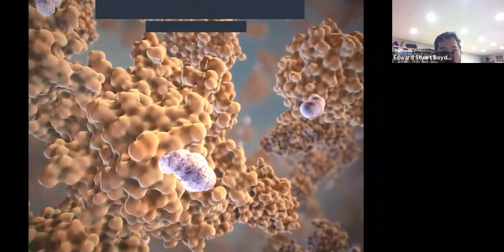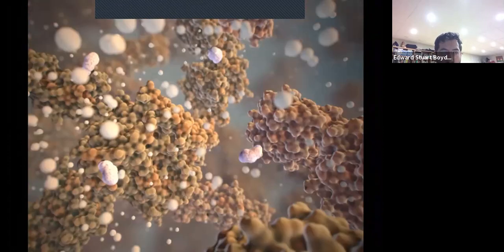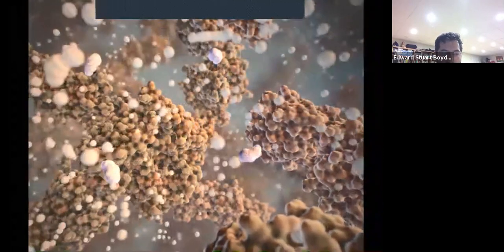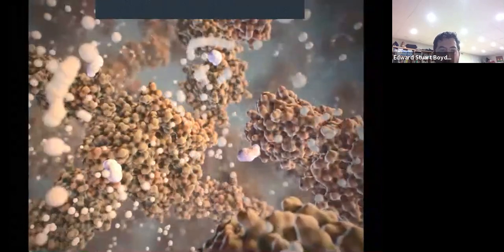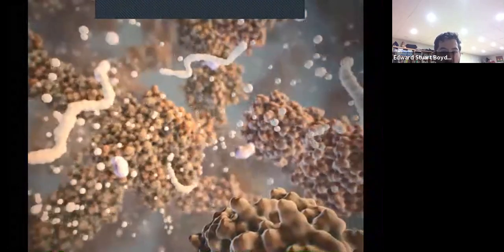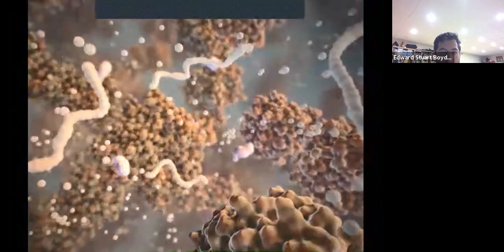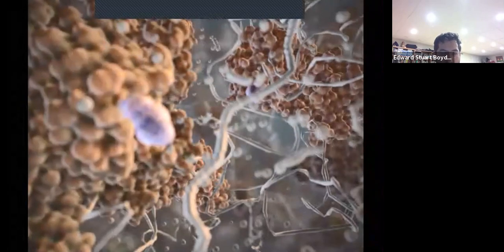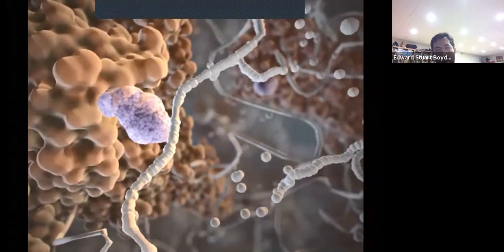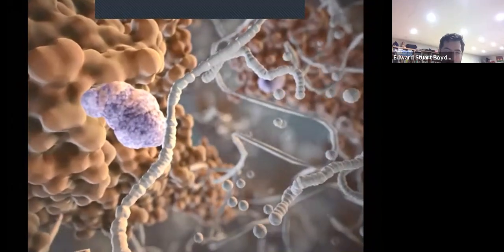Why the handle? Well, we want to make those polymers through a process called polymerization. Here you can see the monomers shown as little white spheres, and they self-assemble into long strings called polymers. Now, if you just do that, you can make the swellable polymer throughout the tissue, but you want the polymer to connect to the handle. That way, when the polymer swells, the handles will let you pull the biomolecules apart from each other.